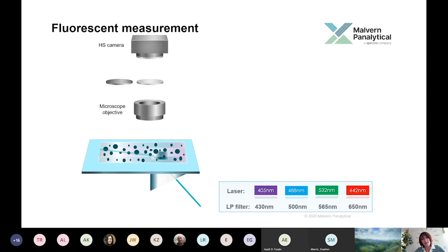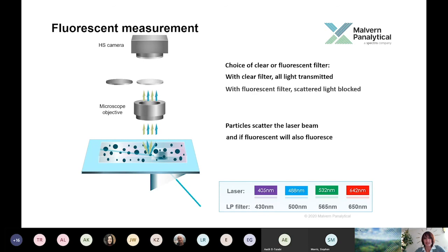So as I mentioned in the very beginning, NanoSight can also detect the fluorescence signal. If you have a sample that expresses fluorescence properties, or you incorporate an attached fluorophore to your virus-like particles, under the light scatter the system will be able to collect both signals, and you will get your measurements as you would normally do with NanoSight.